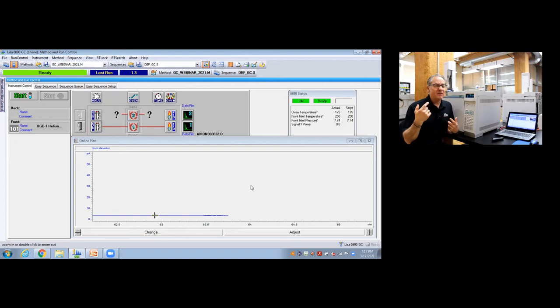I hope you'll forgive the slightly unorthodox setup we've got going on here. We've put a four-way splitter between our two inlets, and on the other two sides, we have an option of what to feed it with. One of them being helium, and the other one being hydrogen. Right now we have it running on helium. You can see through the yellow switch. I may even zoom in a little bit for you guys. We're gonna go ahead and do the first step of switching from helium over to hydrogen. I'm gonna go ahead and turn the helium off. Wait a few seconds, make sure there's no back pressure. Hydrogen on. This isn't what hopefully you'll have set up in your lab. Maybe it'll be a little bit more sophisticated, but by and large, that's all you got to do to the back side of the instrument to switch it over. We're gonna go back around the front and show you guys the last step.